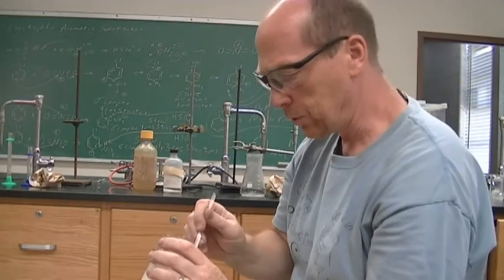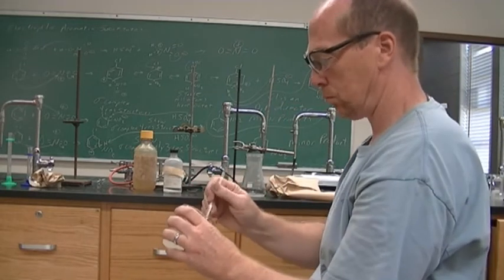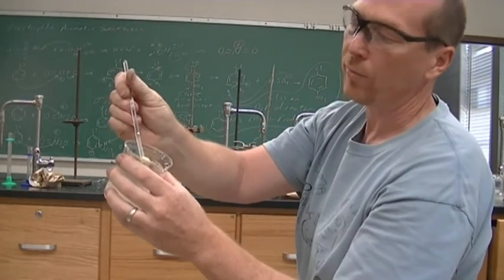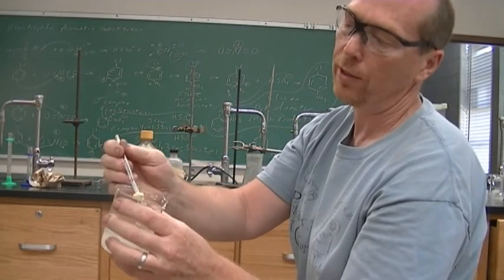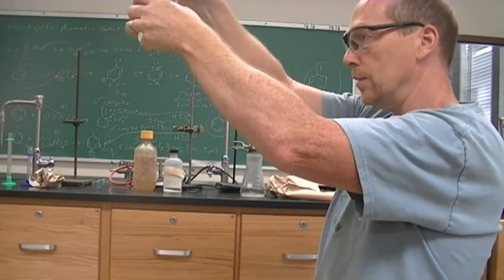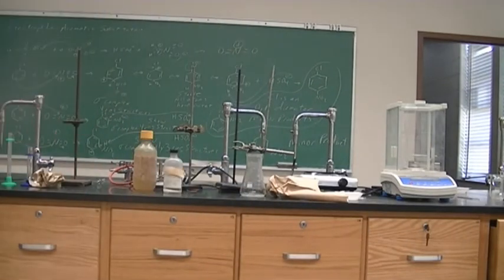I can't quite tell if it's an oil or very fine particles. All right, so it's definitely a solid now. It is now on my stirring rod, so that is definitely a solid. If it was an oil, it would just melt right off. So that is what we want. We've got the solid, and now we just have to collect it on our suction filtration.